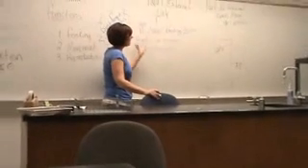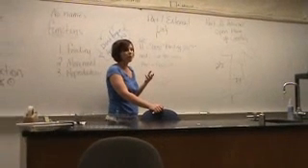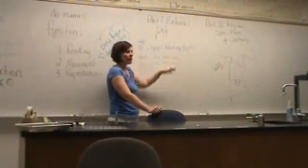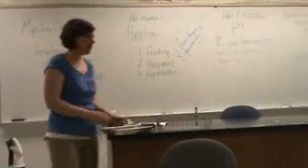Okay, so then you go, all right, those are some ideas as to what these external features are. So now we're going to do the internal. And during this external part, float around, and if they're only pointing out obvious things, if nobody's pointed it out, then you might point it out.